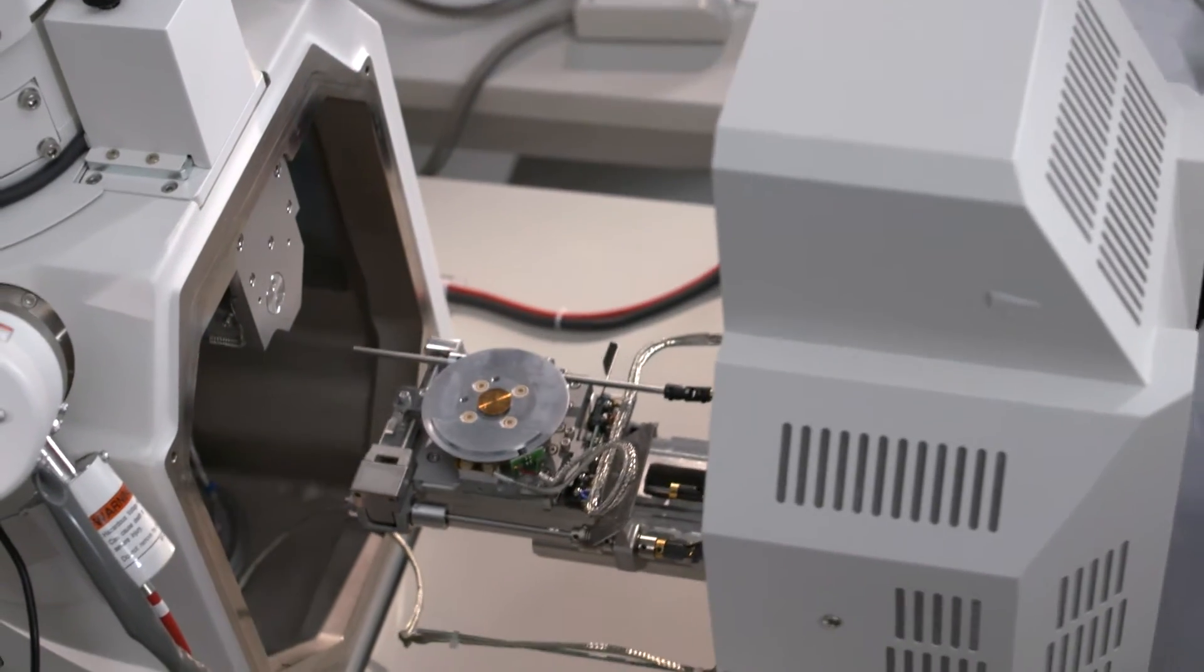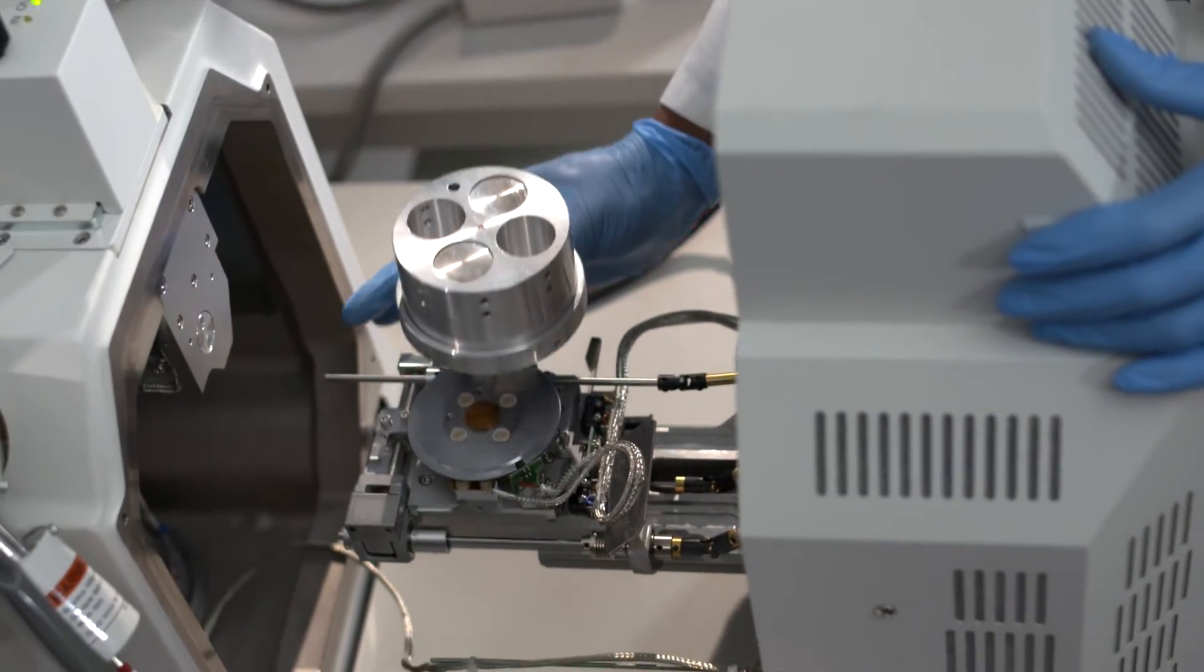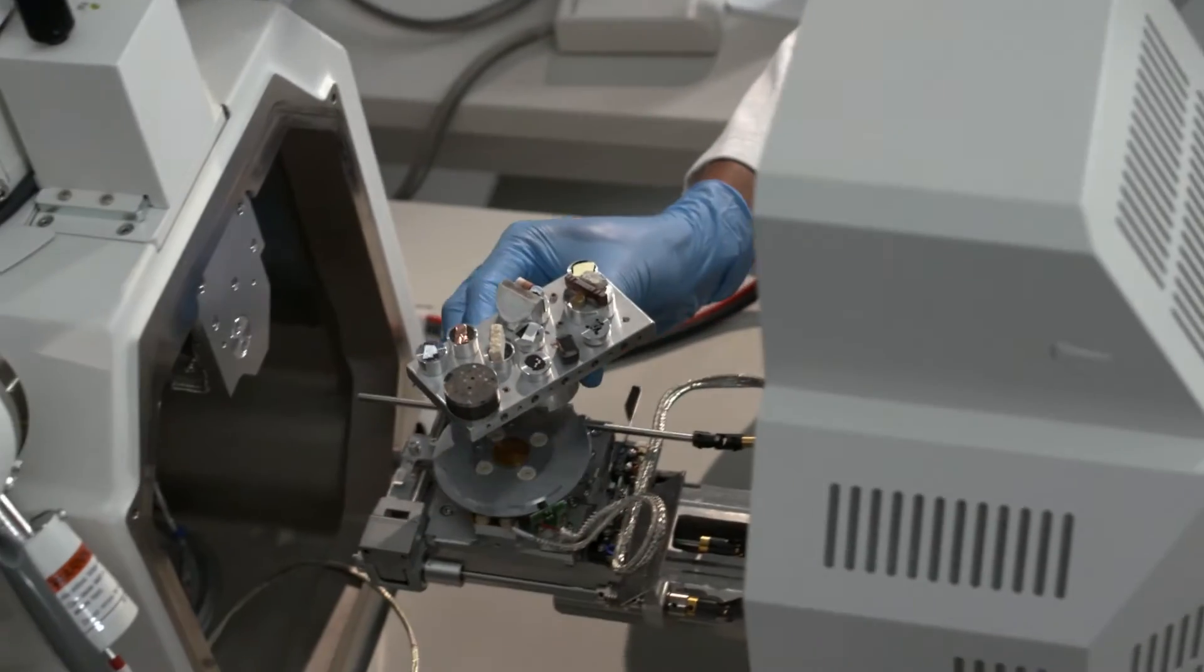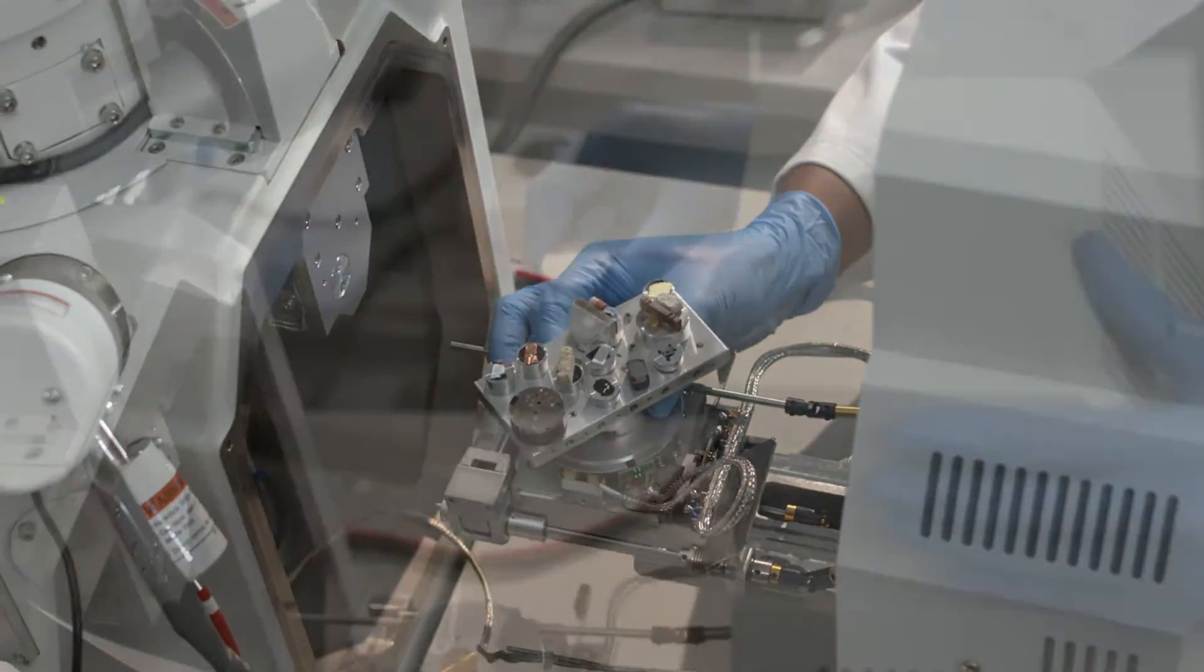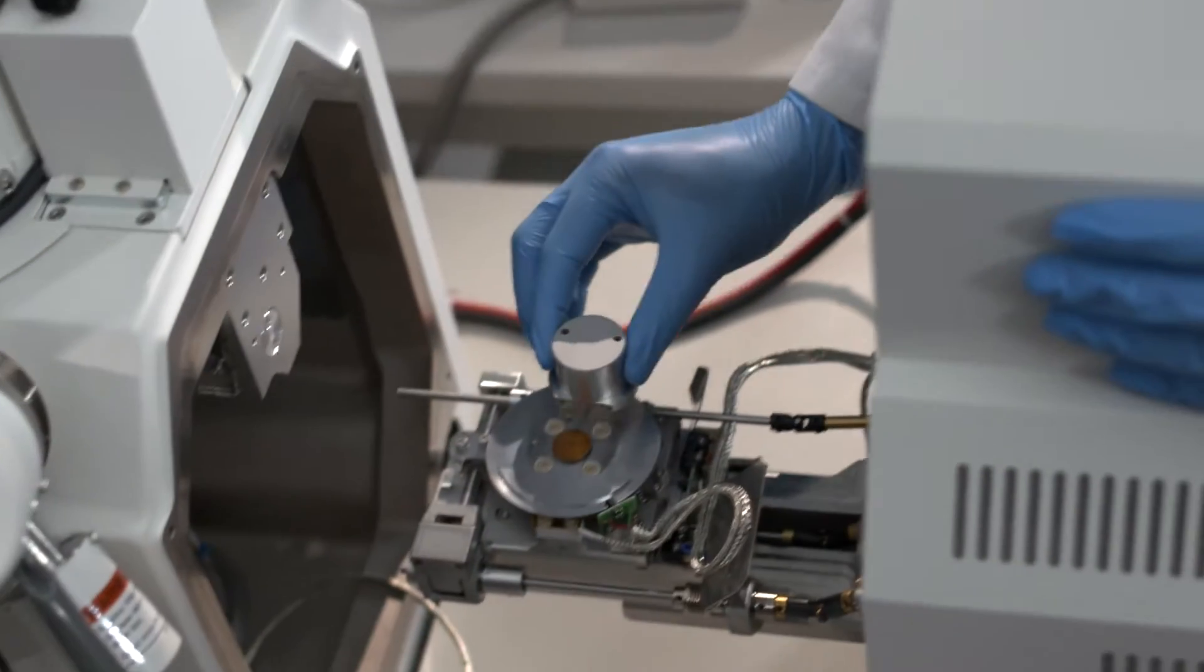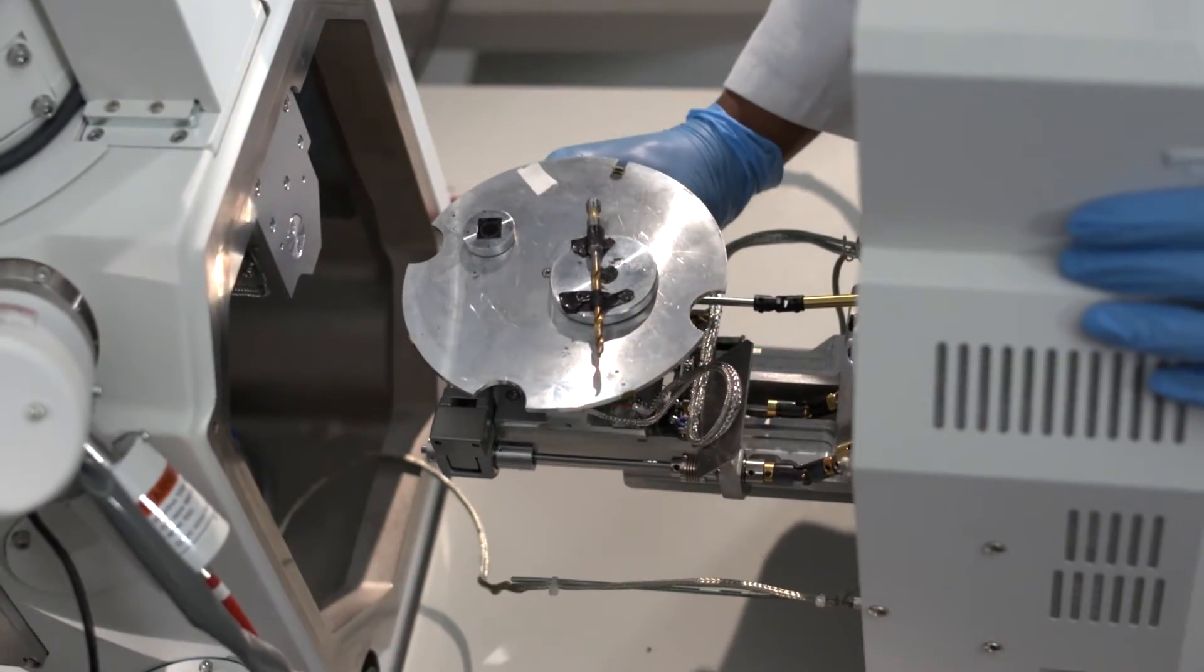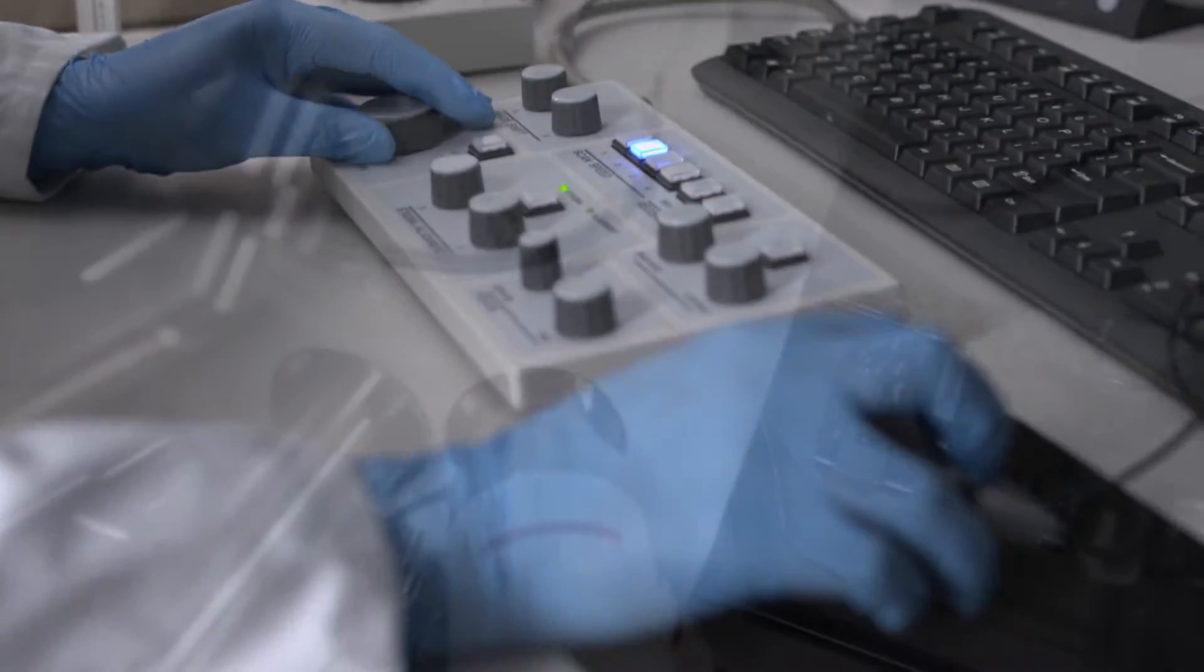A large door-mounted sample stage is built to accommodate large specimens up to 200 millimeters diameter by 80 millimeters high, while providing a fast pump-down time of less than 3 minutes to observation, allowing further flexibility for sample imaging.